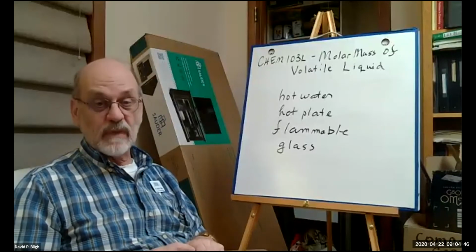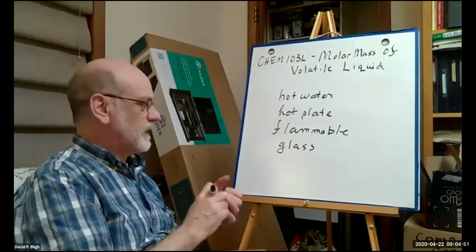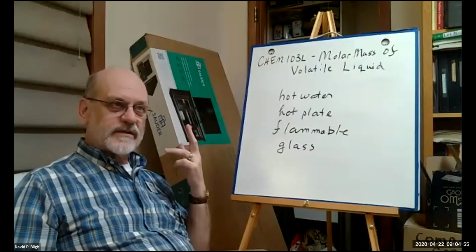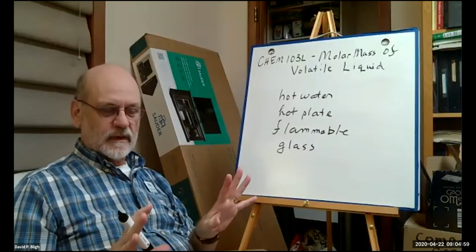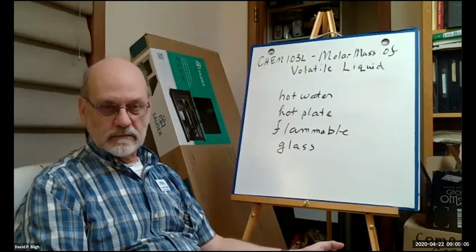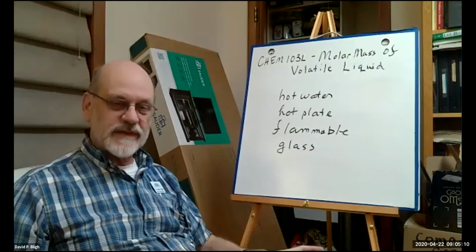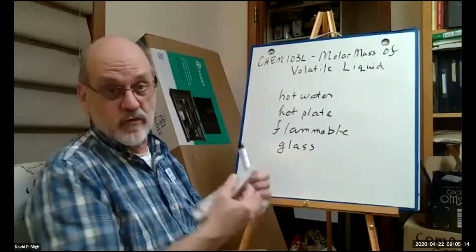You'll be picking them up months later in corners on the other side of the room. So what else? Protect your eyes, protect your hands, lab coat, closed-toed shoes, cover exposed parts of your leg. That's if you were in the lab doing this hands-on. Those are safety issues that have to be in your report.